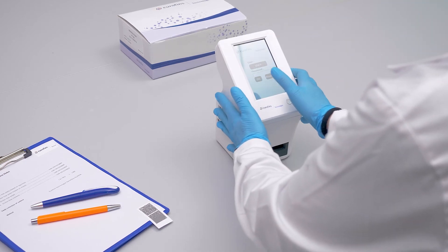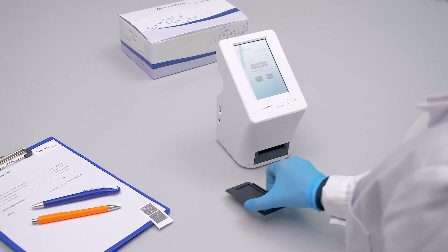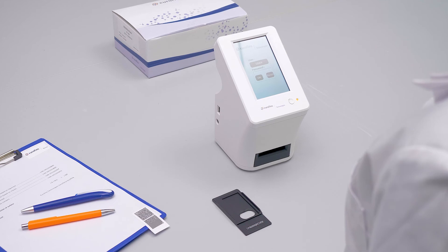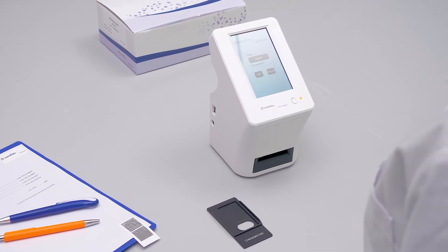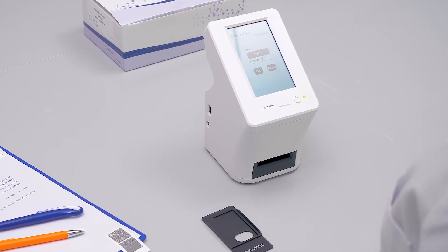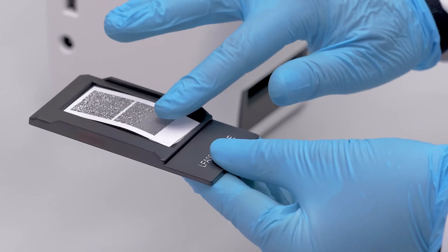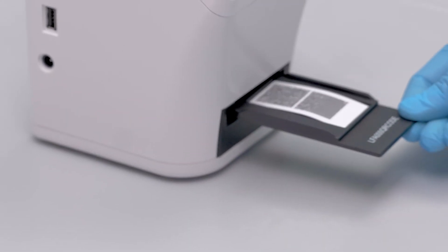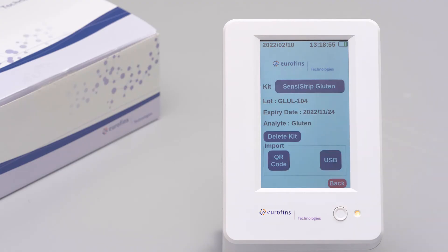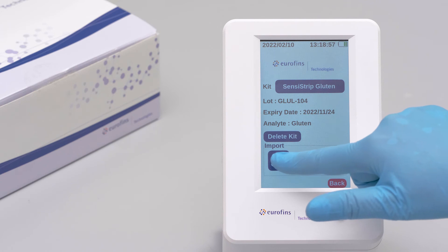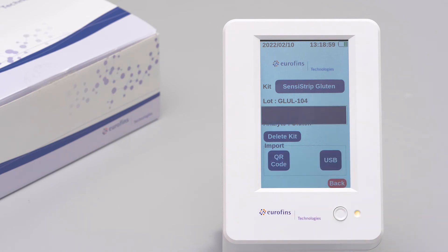For a digital interpretation of the results, a new portable reader designed to eliminate uncertainty and personal interpretation can be used. Turn on the reader and insert the QR code provided in the kit using the appropriate adapter to load the method and batch information into the machine.